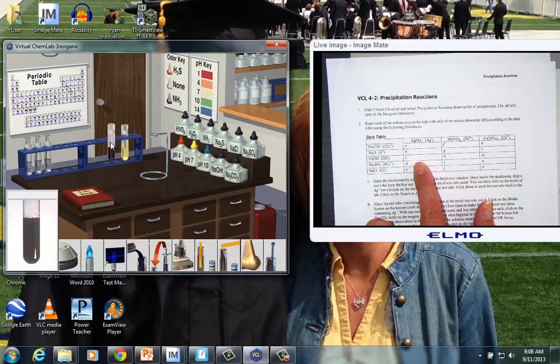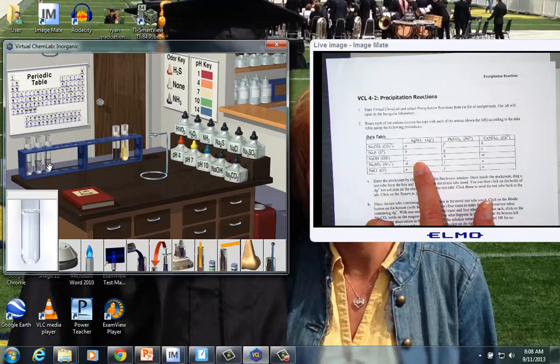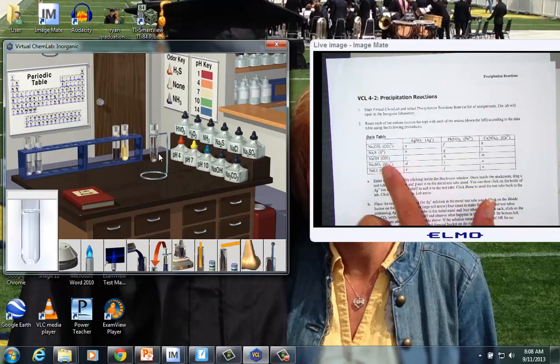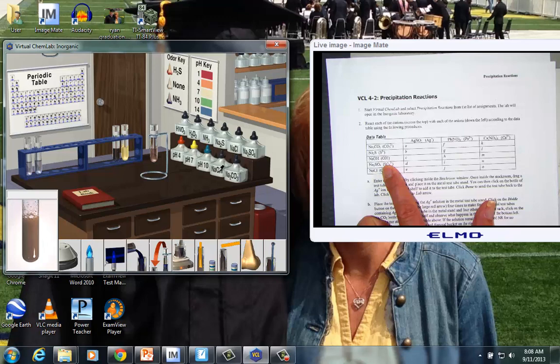Drag that over, put it into the test tube rack. There it goes. Click the third one over. Now we need to add sodium hydroxide, NaOH, sitting down here. So I just place my cursor over and click on that reagent bottle. Yep, that is a definite positive test. That's probably more of a brown solid.